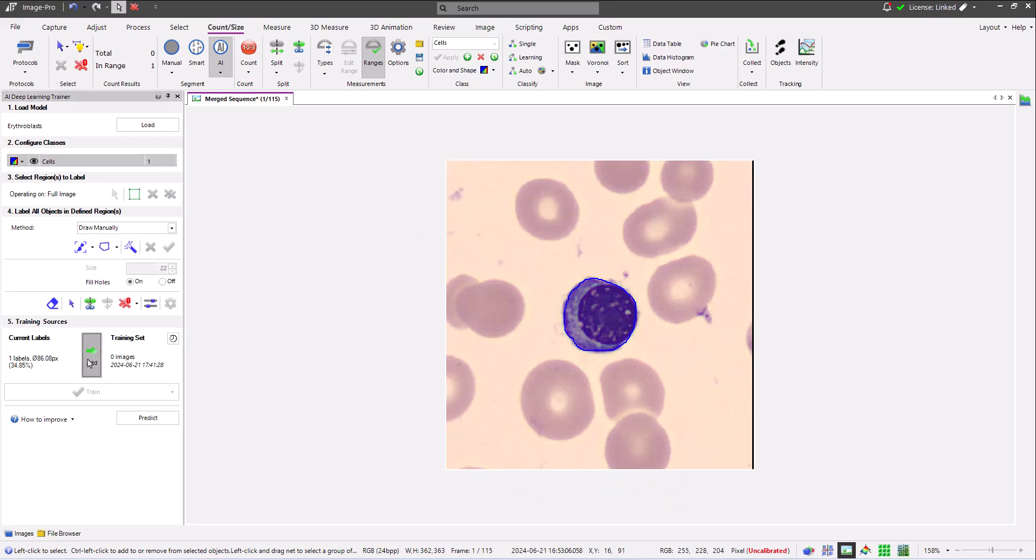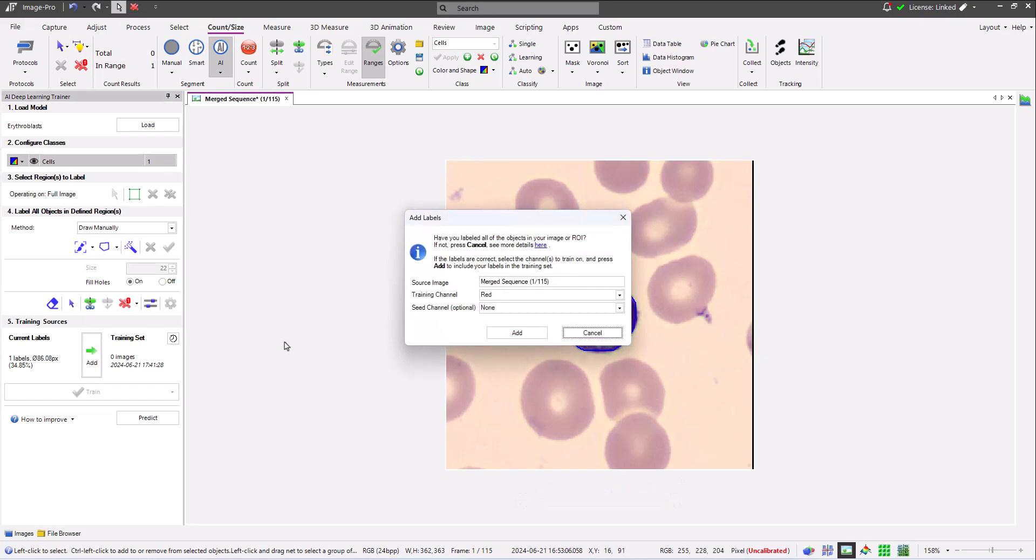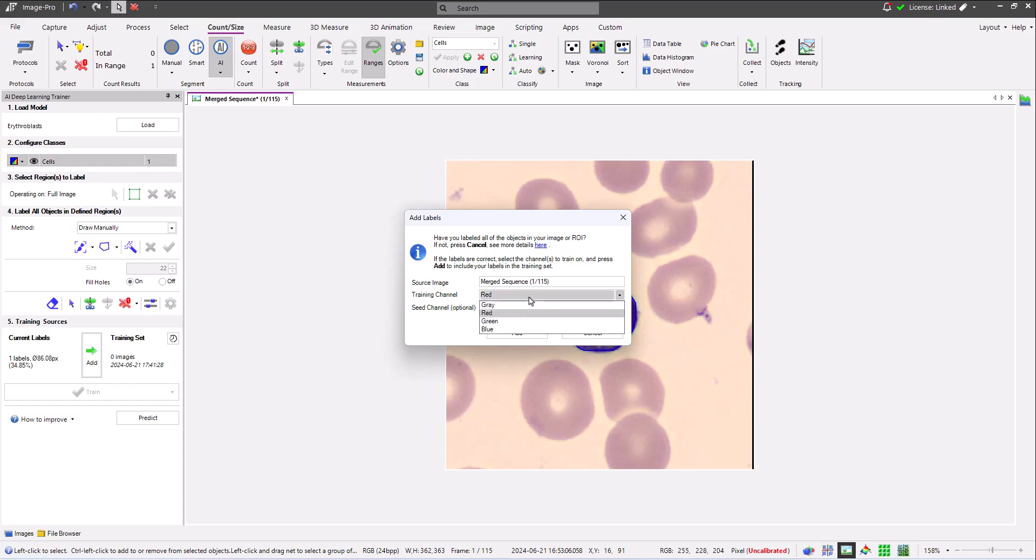After clicking add, the add labels dialog opens. Use this dialog to ensure that the correct source image is active, to select the training channel and the optional seed channel. My images are color, so the training channel could be red, green, or blue components of the image, or the gray channel which is a combination of all three.